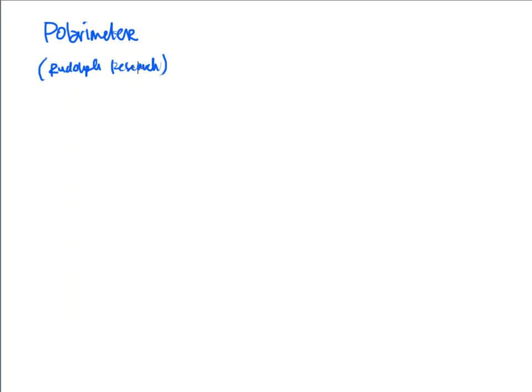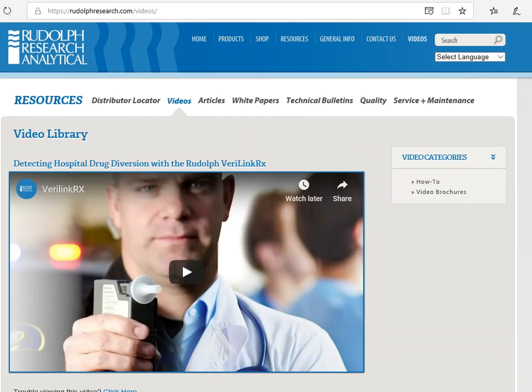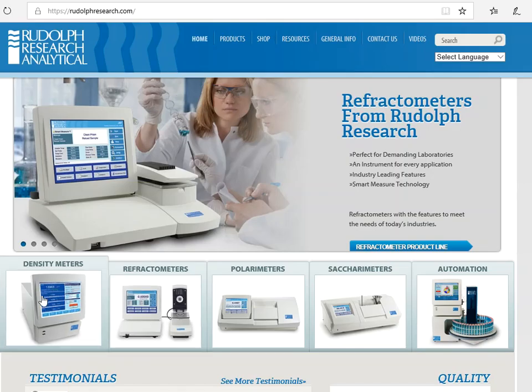So, I want to talk to you about what a polarimeter actually does and what its purpose is and why we would use it. But you're eventually going to refer back to the same website, okay? The same website that was used for the density meter. If you go back to the home page, you're going to see the product line that's going to be listed. The density meter we've already talked about.